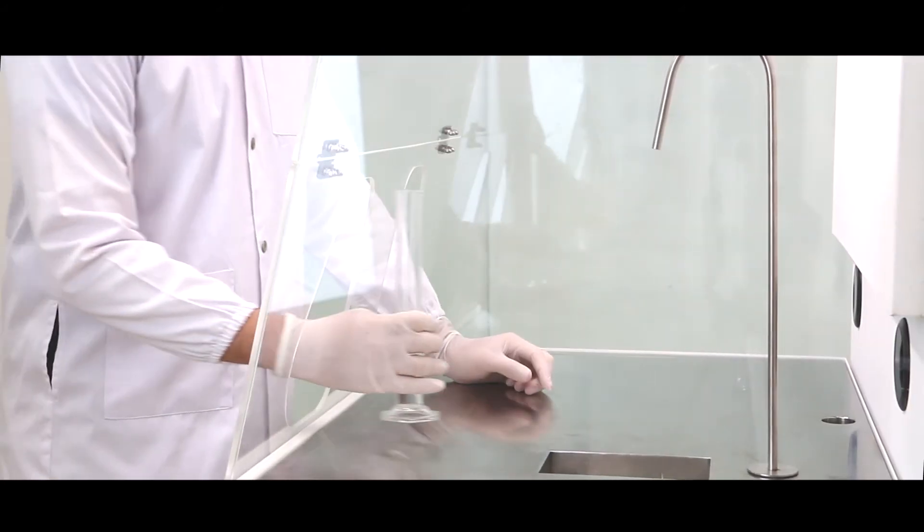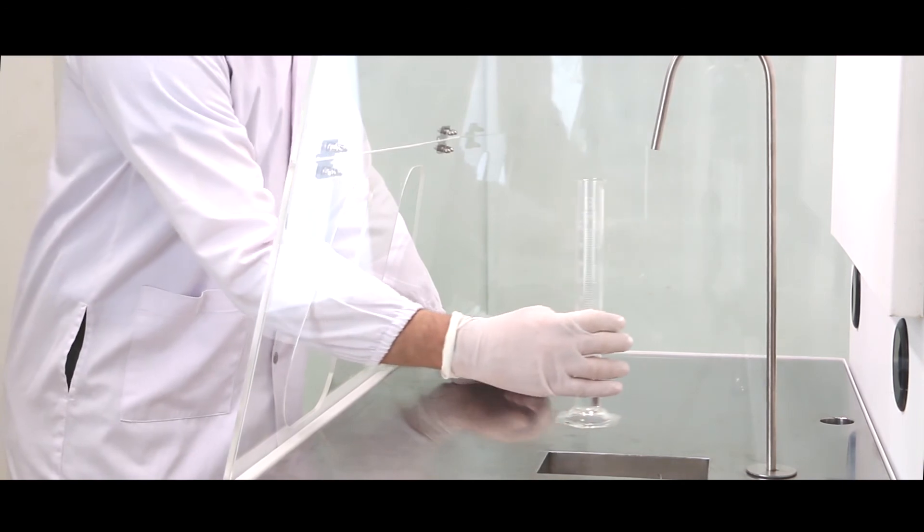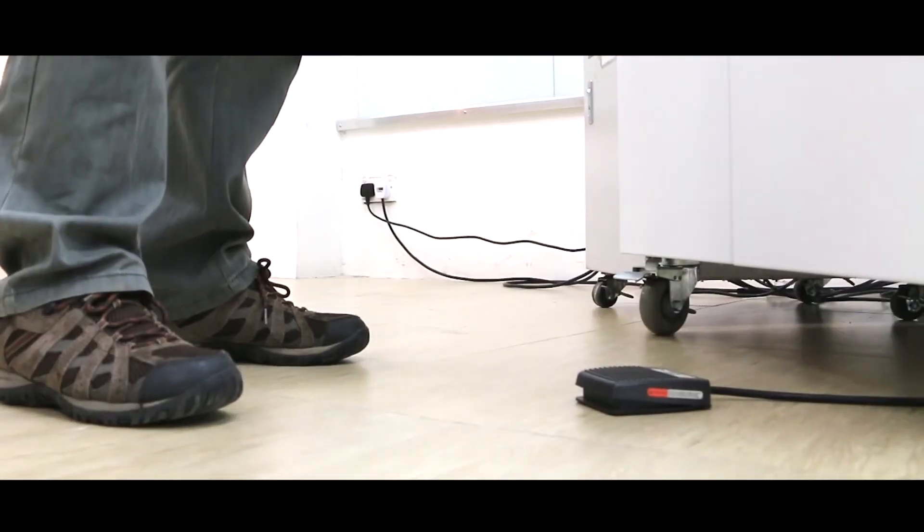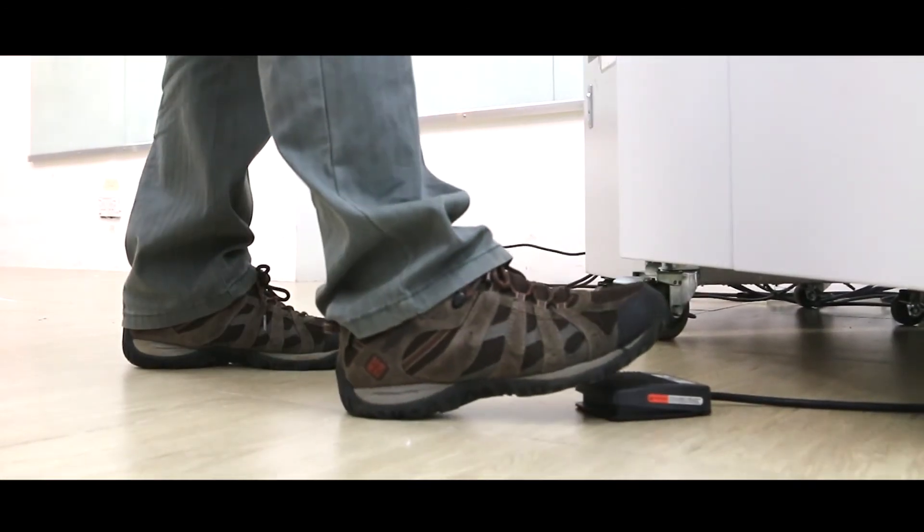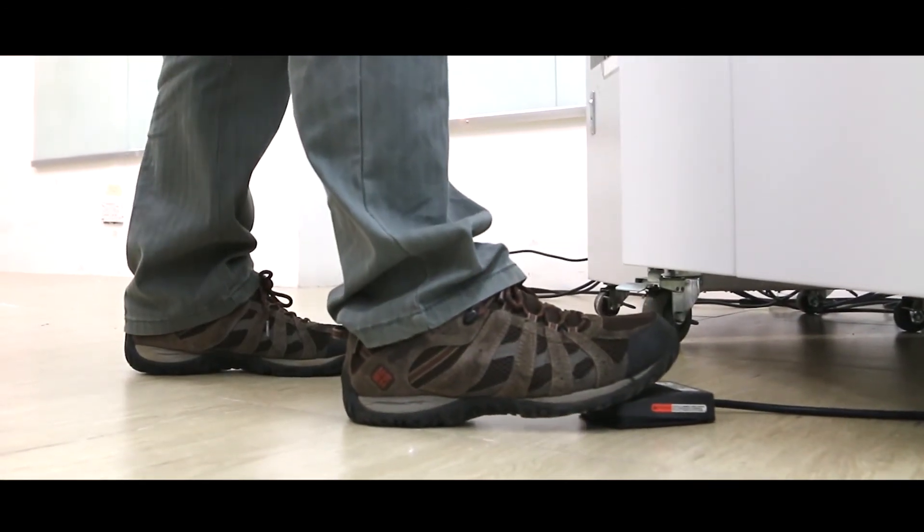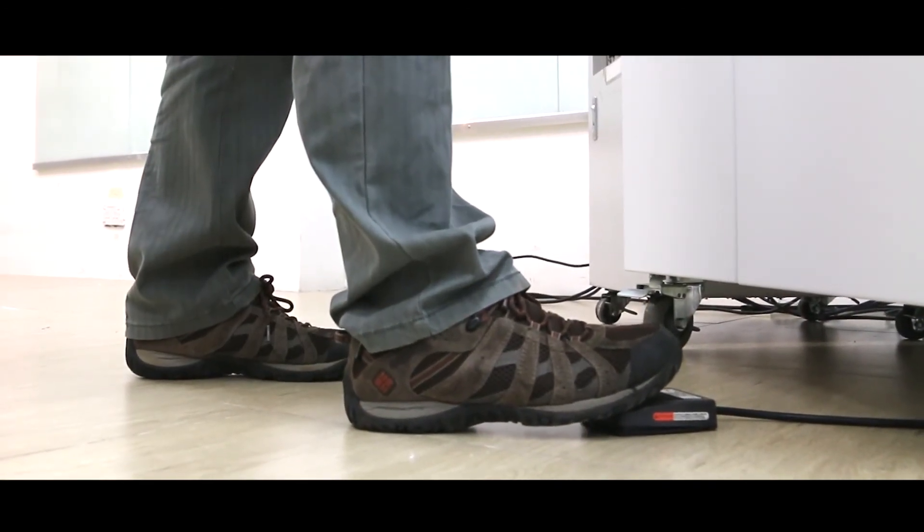Dispensing formalin is easy with its built-in motor pump which can be controlled remotely with a foot pedal.